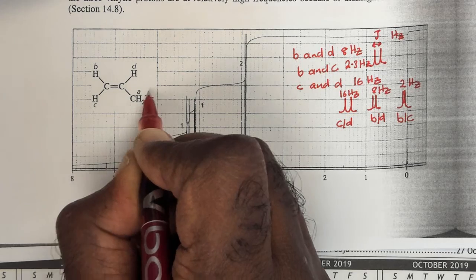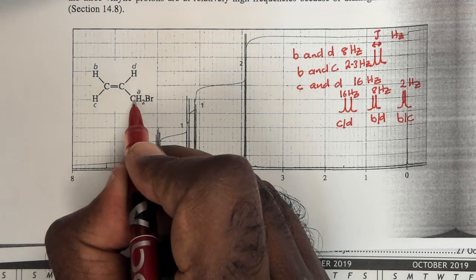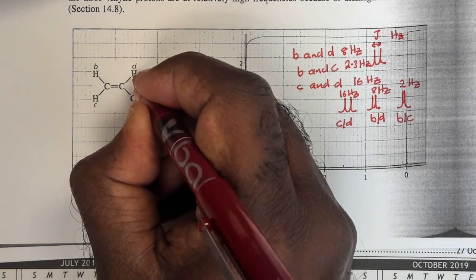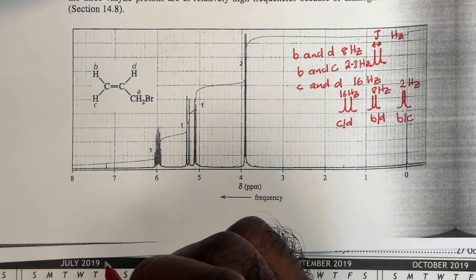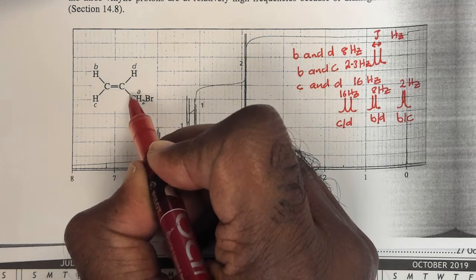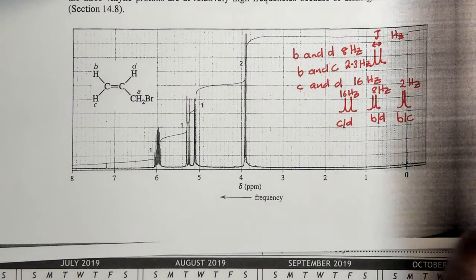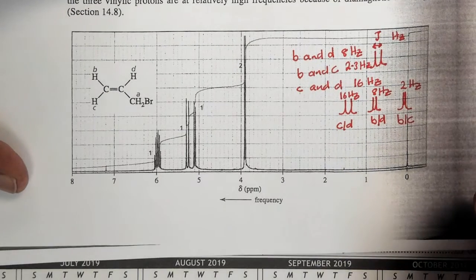And you see 3-bond coupling away to the CH2, and that's the CH2 splitting there, and there's a very small coupling constant between these two protons and that hydrogen, but this gets split into a triplet. So our normal n plus 1 rule, we'd split this hydrogen into a triplet. And the fact is, because these two hydrogens can now freely rotate around that bond, this hydrogen will be split by 2 protons, and what we would get is a triplet for D.